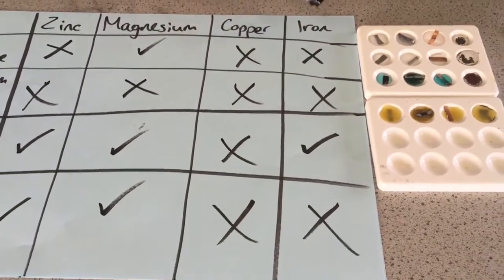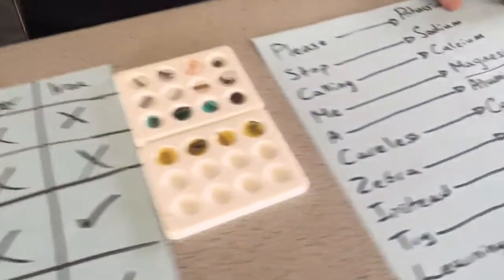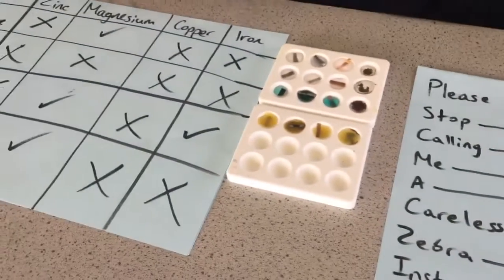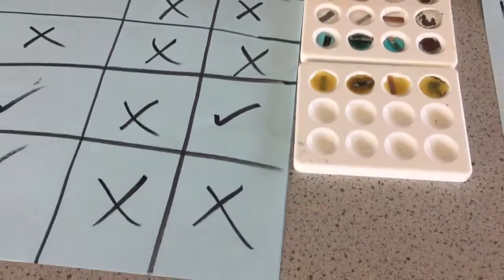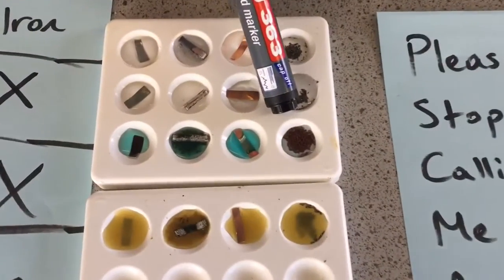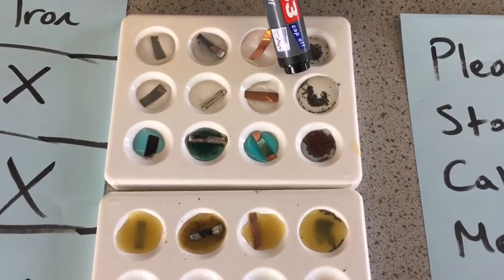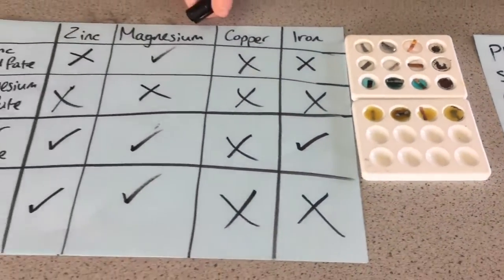Copper's a little weakling. Is that why they use it in water pipes, sir? I would say so, sir. Probably so it doesn't react with things. Brilliant. And then finally, iron. Bit of a mixed bag with iron. But look, sir, look at that lovely colour change. We've gone from silvery black to a lovely red colour. So we've had a reaction take place.